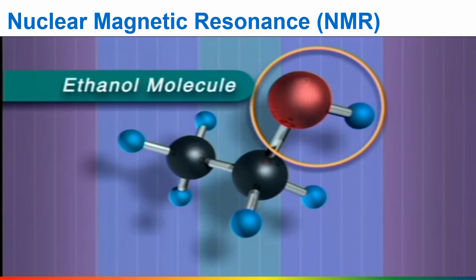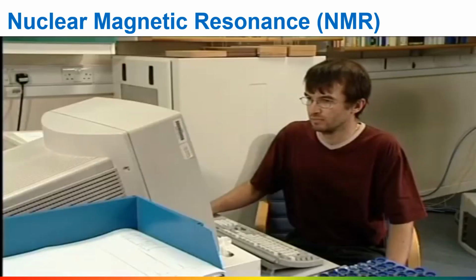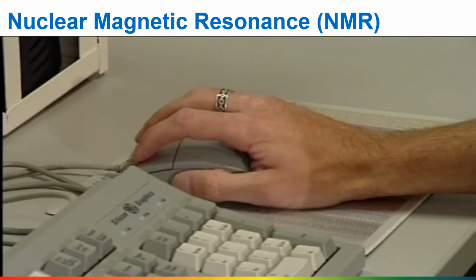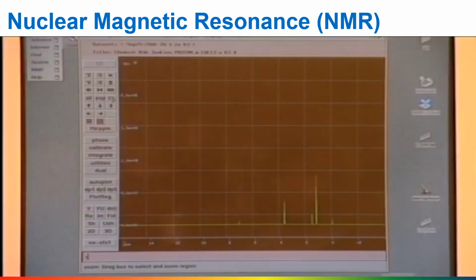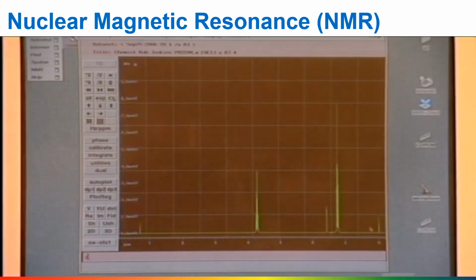This energy is picked up by a receiver in the instrument and looks like this. A strong signal gradually dying away. This is the total signal from all of the hydrogen nuclei in the sample and is very difficult to interpret. However, a mathematical technique called a Fourier transformation can be used to separate out the signals from hydrogen atoms that are in different molecular environments and present them as a spectrum that can be interpreted by chemists.